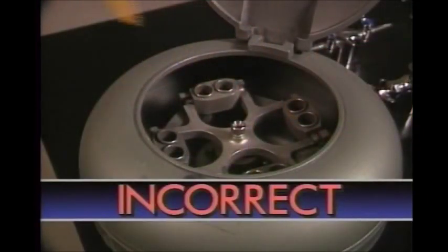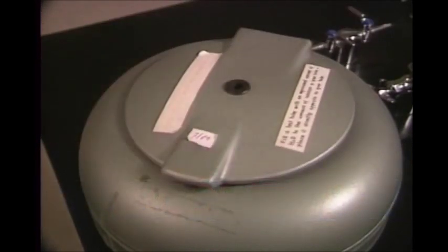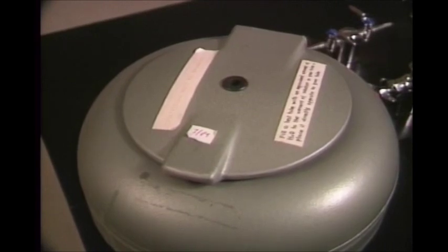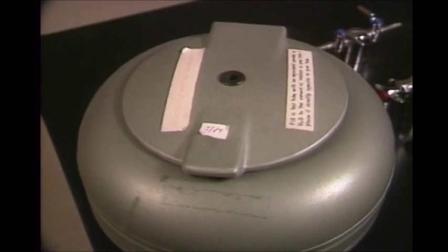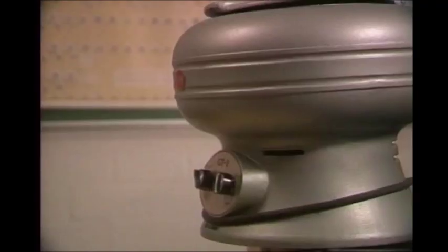When the test tubes inside aren't evenly distributed, the centrifuge is unbalanced. It vibrates like a washing machine with an unbalanced load. If the vibration is bad enough, it can fall off the benchtop.